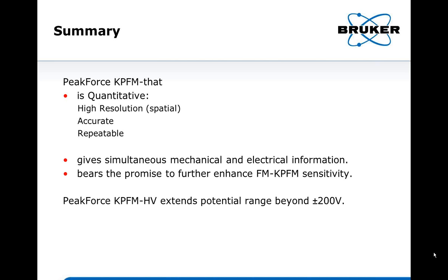Another question here: if I put a semiconductor layer on one electrode, and I'm measuring the surface potential, what does the surface potential mean then? Is it the work function difference between the two electrodes? I think that's a very interesting question. Let's say you just put a very thin layer of semiconductor or metal on some other substrate. What's the contribution from the underlying layer and the top layer?